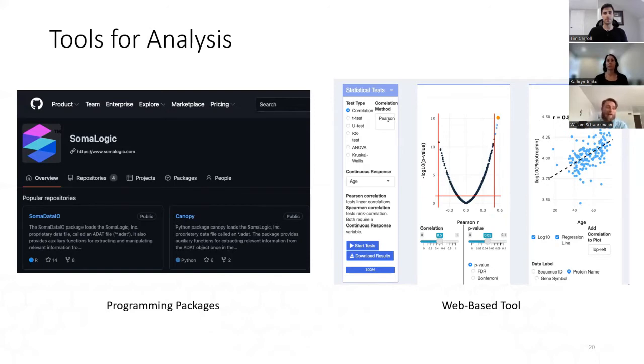So if you're using Pandas or SciPy or machine learning packages in Python, or if you're using limma, edgeR, something like that in R, our data will work with all those through the use of our packages, or you can write your own scripts to be able to process the data. Again, everything will be processed out of the text files. These packages just make it way easier to work with.